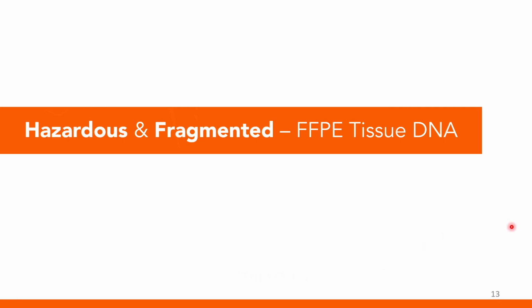Okay, so that's the first part of my presentation, and let's move to the second part of my presentation about hazardous and fragmented FFPE tissue DNA.